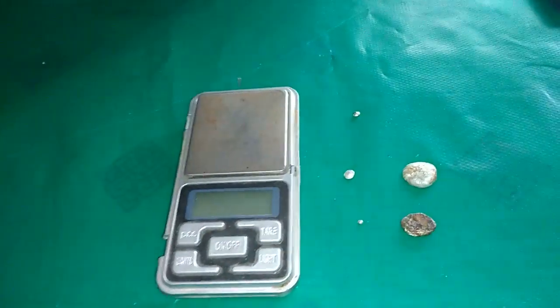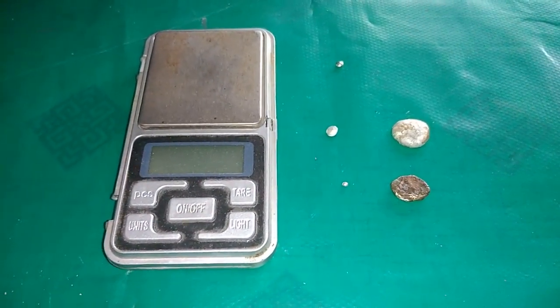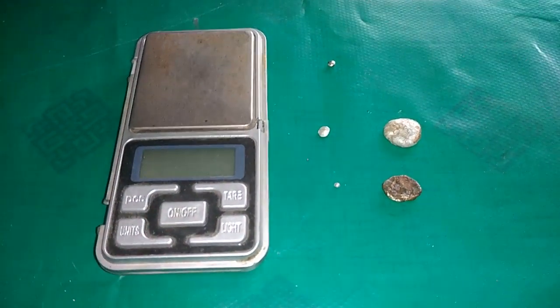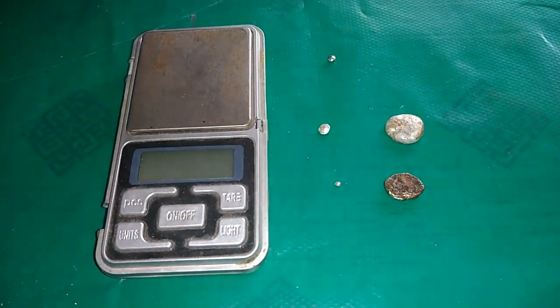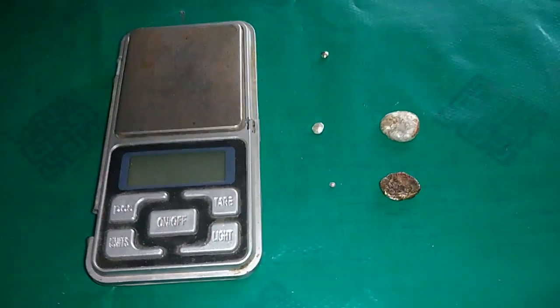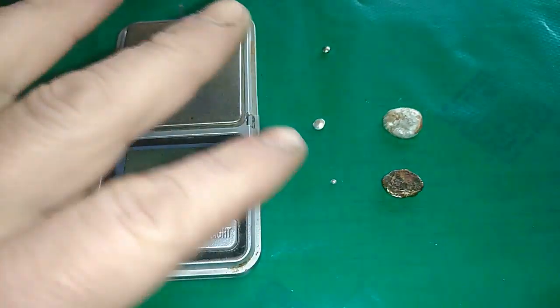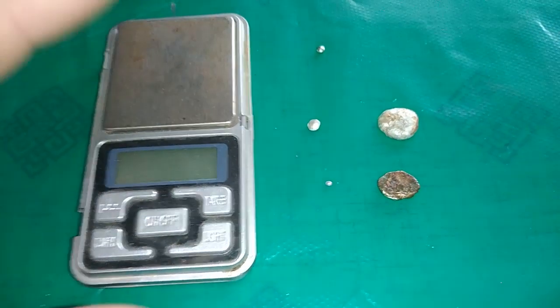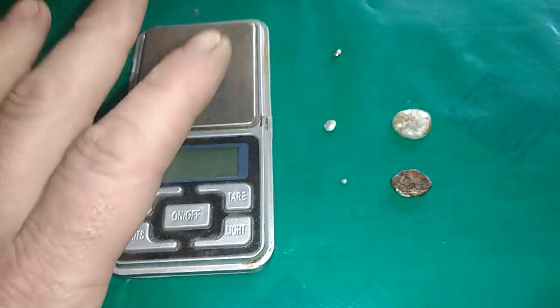Hey guys, welcome to the third part of MLCC Precious Metal Recovery. After I melt all this red brick palladium and that silver from MLCC, I have some results. So I want to share that with you today, like I promised. I melted everything separate, just because I want to show you what I get from that amount of MLCCs. And let's start.